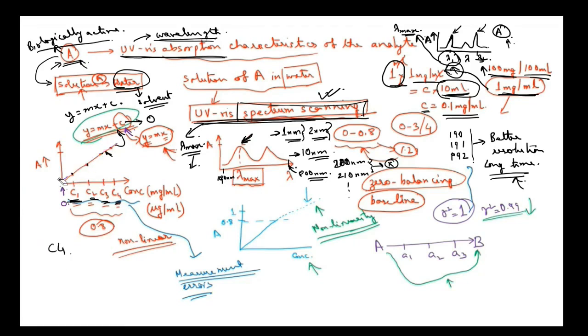Another important thing over here is that, while you are doing so, one of you asked, sir, what happens if the solvent also absorbs some radiations? And definitely yes, even though I am telling that water is transparent, it would absorb some amount of the electromagnetic radiations. There are many solvents also which have the capability to absorb a large amount of radiation.